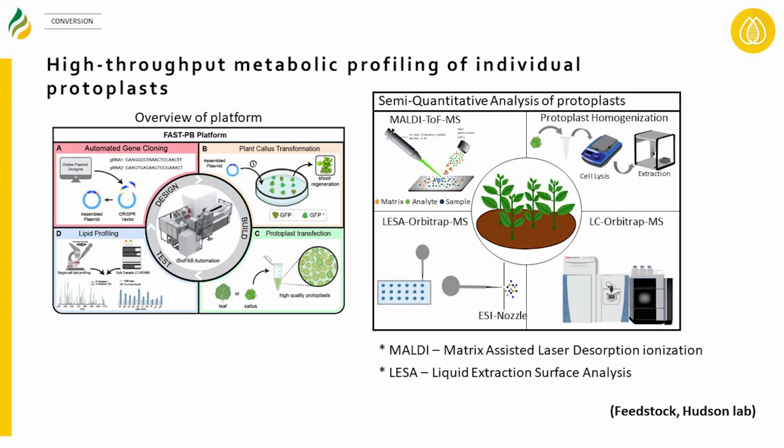And so I've sort of really quickly, I noticed we're already over on the session, talked about high throughput for MALDI, which allows very high throughput, and then LESA for surface analysis, and then how to take this for imaging, as well as single objects or single cells, single guard cells, for example, if that's what you need, or even surveys across a broad range of chemical and spatial information.